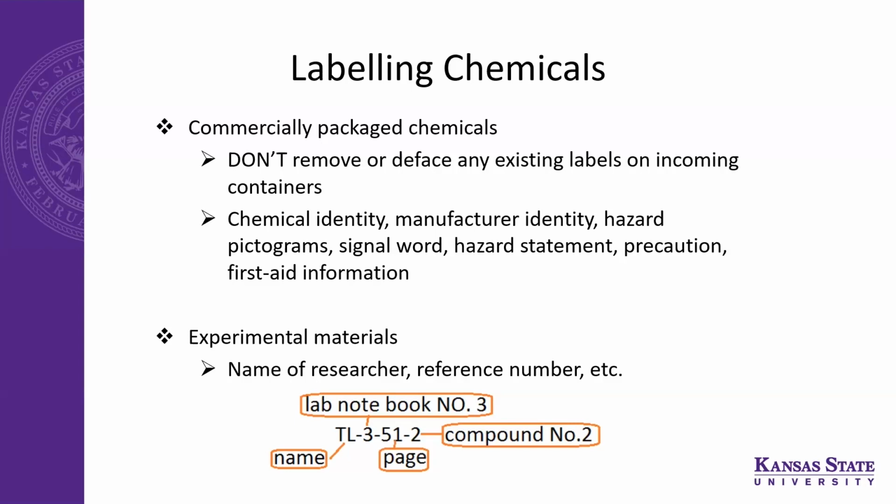Again, this is an issue that we faced when we were cleaning up some of the vacated labs in our department. There were chemicals, some did not have any labels, and some just had structures. Even as a chemist for like 20 years, even I don't know some, right? So it is important to create the labels properly, and provide as much detail as possible, because one day you may be gone once those chemicals are being disposed. So the more information, the easier it is for others to deal with.